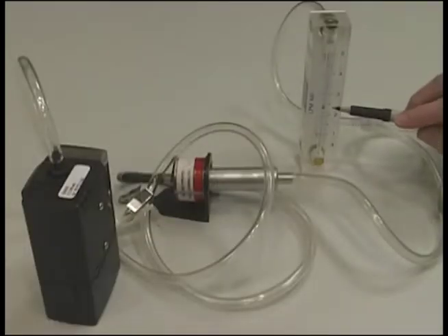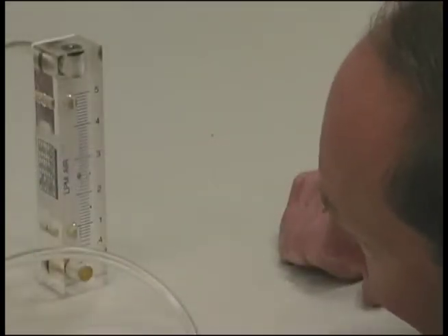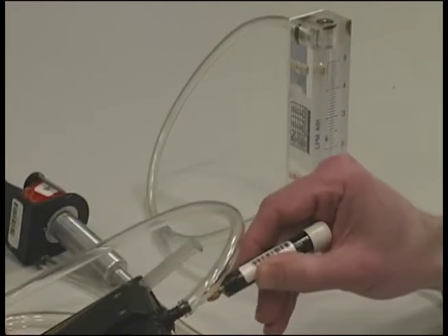With everything sitting on a level flat surface, check the ball float in the rotometer. Be sure to take your rotometer reading at eye level and use the center of the float for the value. The flow must be reading 2.5 lpm. If you need to adjust the flow, use the set screw on the pump.